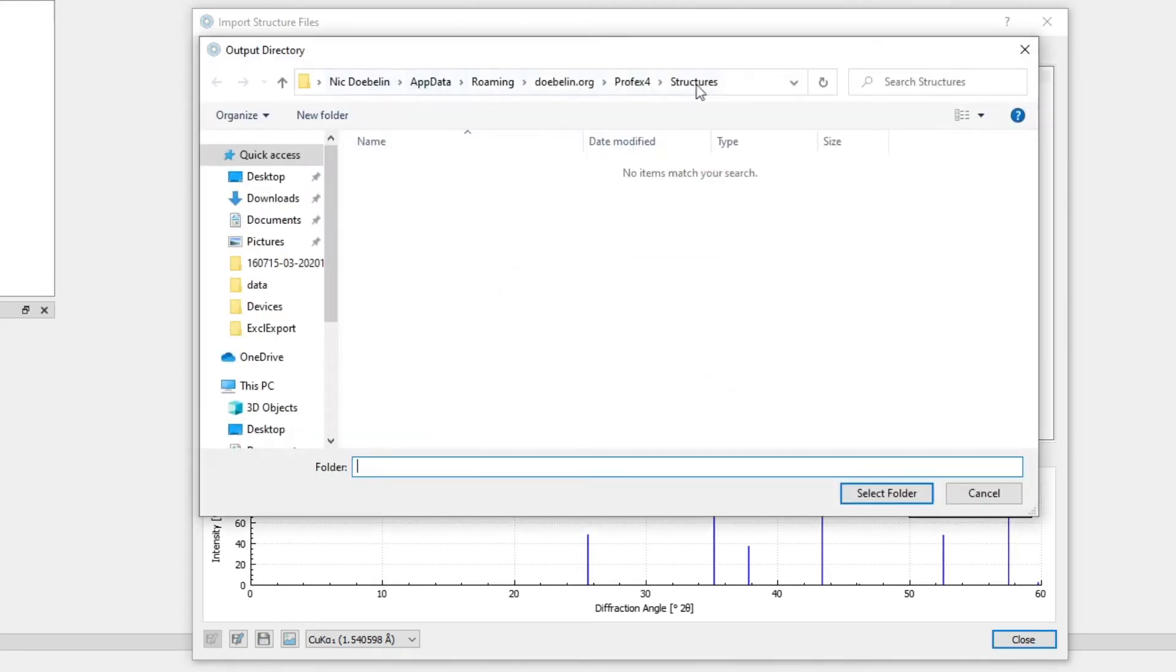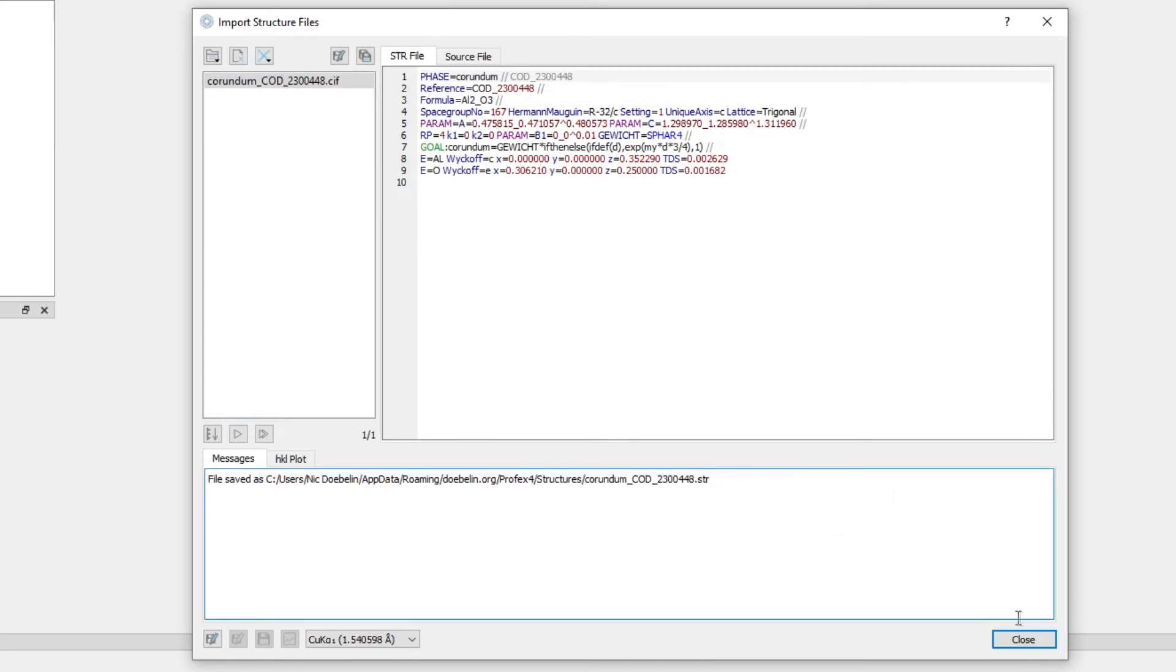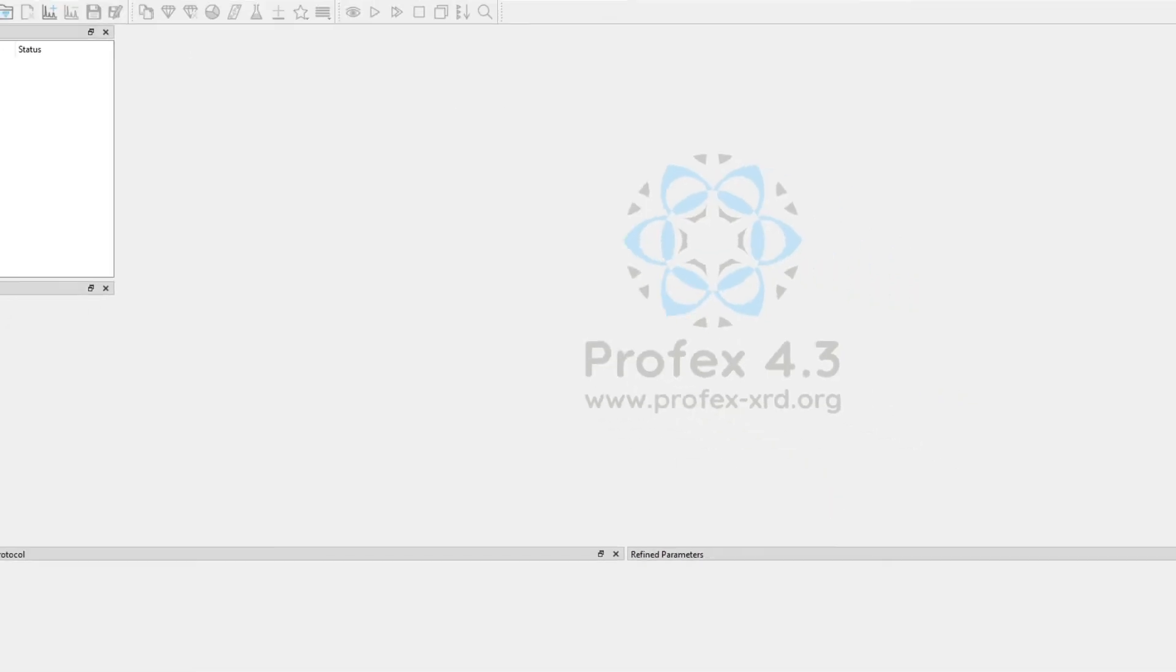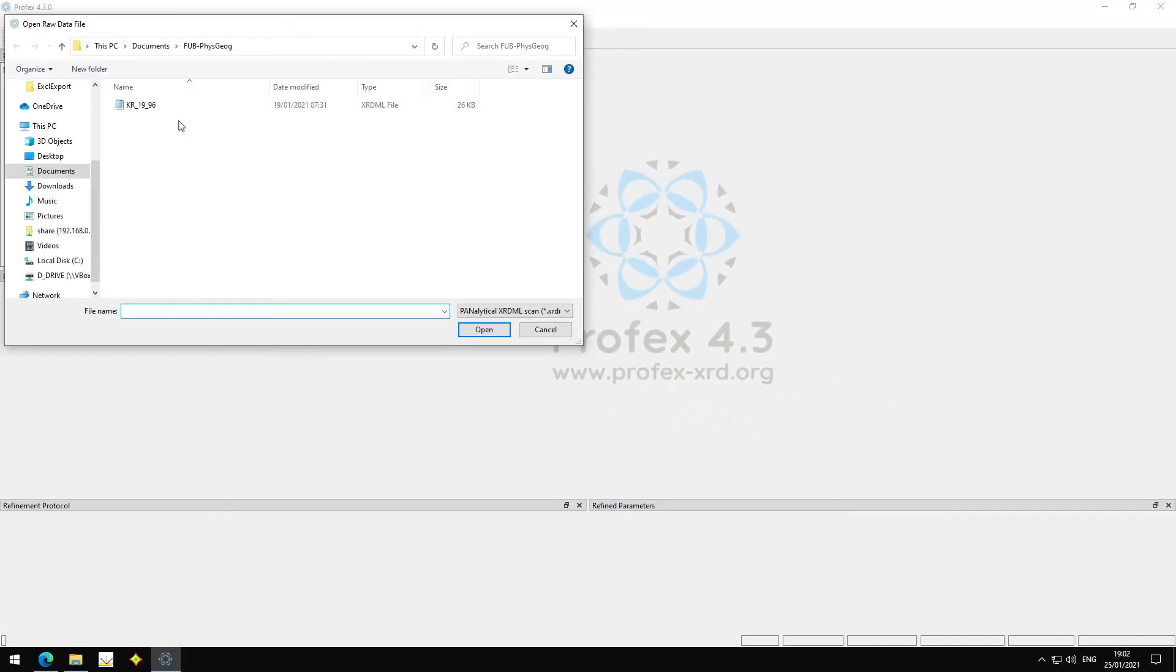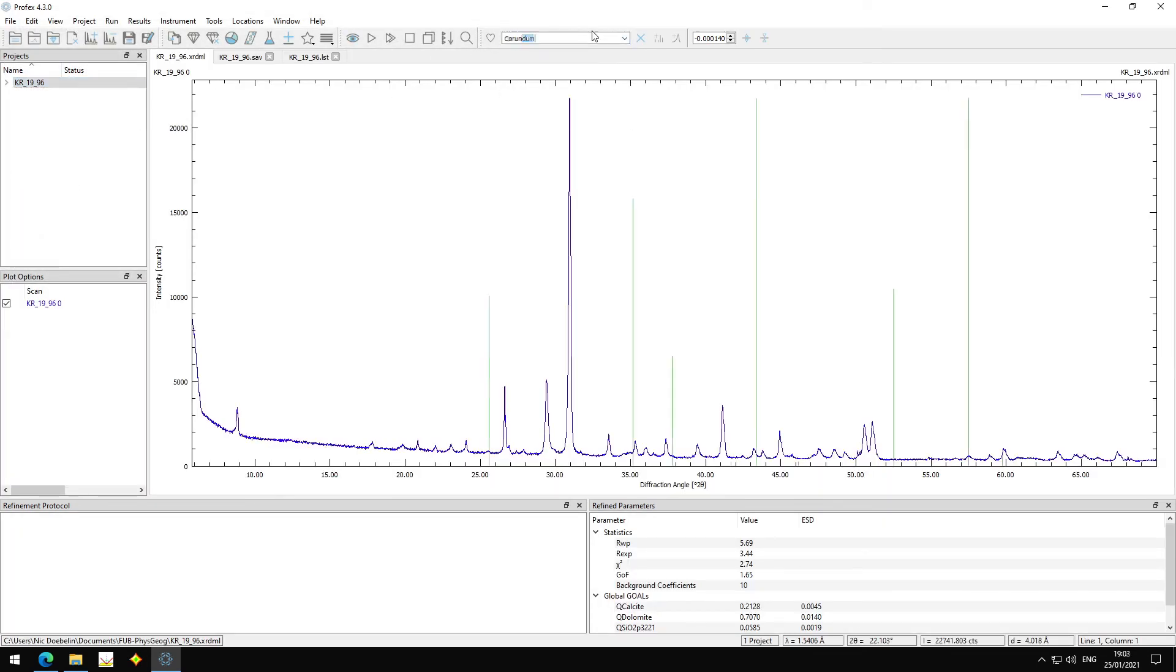And all we have to do is save it in a structure file repository. For example, the default is always our personal repository, so I select this. It was saved here. I close this dialog. It will automatically index the new structure. And now I should have it here. I have to open some scan file, and if I search for Corundum, this is my new imported structure file.